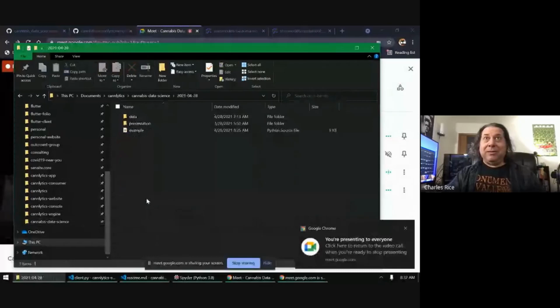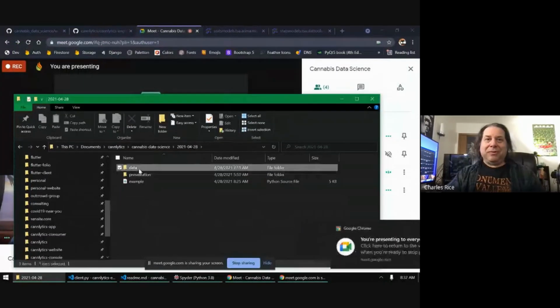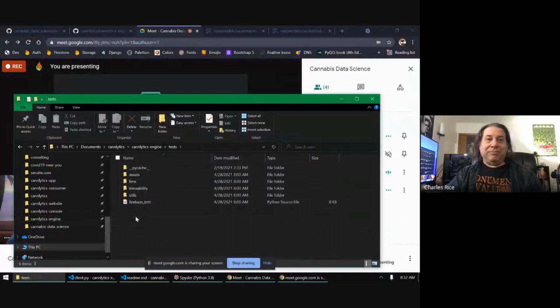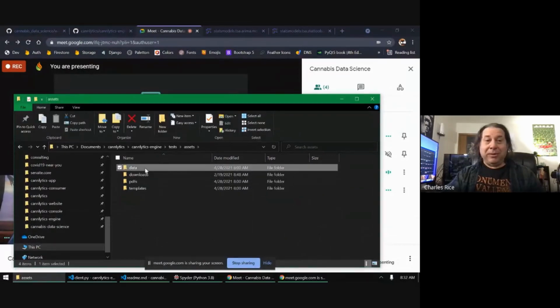Yeah, so it's this pandas code that reads in a text file from this Shimadzu Nexera, and it just cleans up the data and the column names and puts it into a readable pandas data frame.